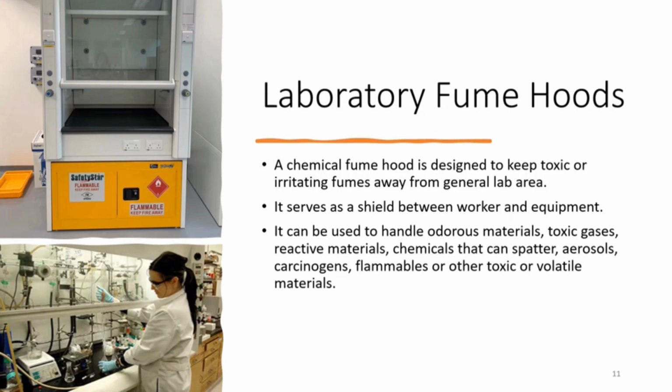Firstly, the shield must be lowered down to a certain level in order to serve the protection purpose. Secondly, only your hands should be inside the fume hood to do the operation, not the other parts of your body. Because sometimes students want to see the chemicals clearly, so they squat down and then their head is actually partially inside the fume hood. Again, that means you are being exposed, right, to whatever toxic or irritating fumes, so that is not the correct practice.